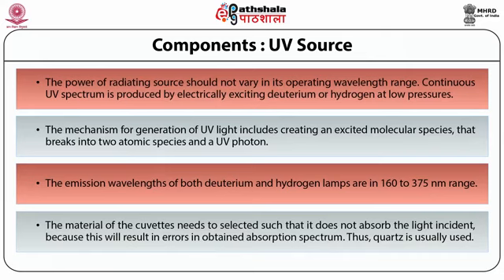So the material of the cuvettes needs to be selected such that it does not absorb the incident light, because this will result in errors in the obtained absorption spectra. Thus, quartz is usually used.